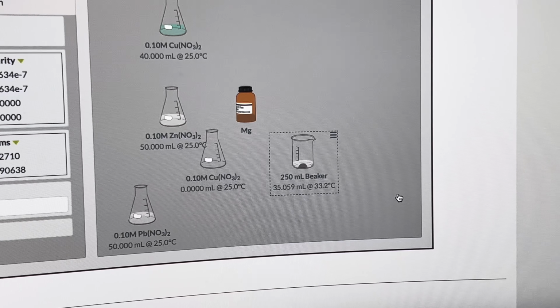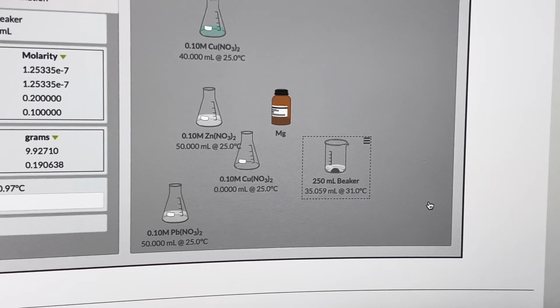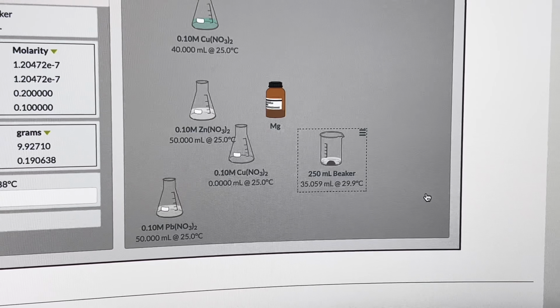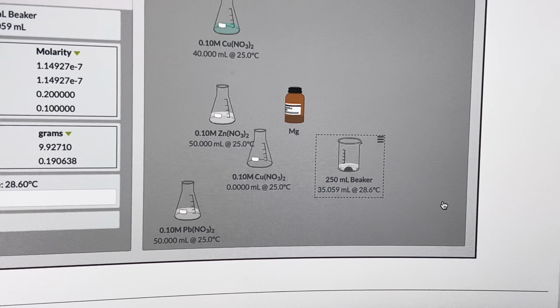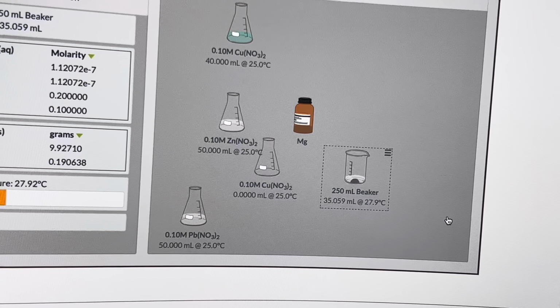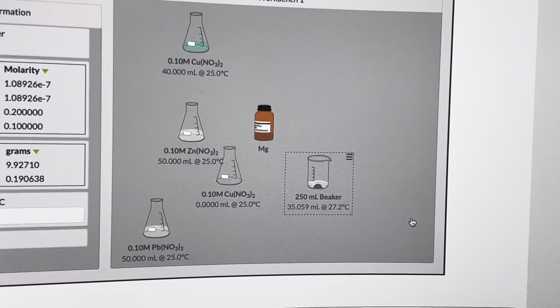As the reaction is occurring, we can determine that the temperatures are changing, pH levels are changing, and after the reaction is completed, the solution does turn clear and colorless, and the metal does turn lighter in color. And based on these observations, we can safely assume that the reaction does occur when we mix magnesium metal with copper nitrate.